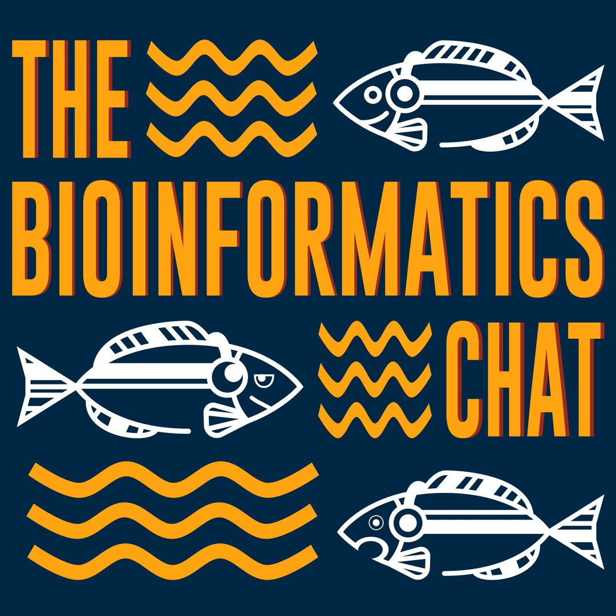And this approach was originally proposed for Sanger reads, the De Bruijn graph approach, but it turns out that it was actually much more useful for the next generation of sequencing technologies, such as Illumina sequencing. And this is how we denote this set of technologies, next generation sequencing technologies, right?